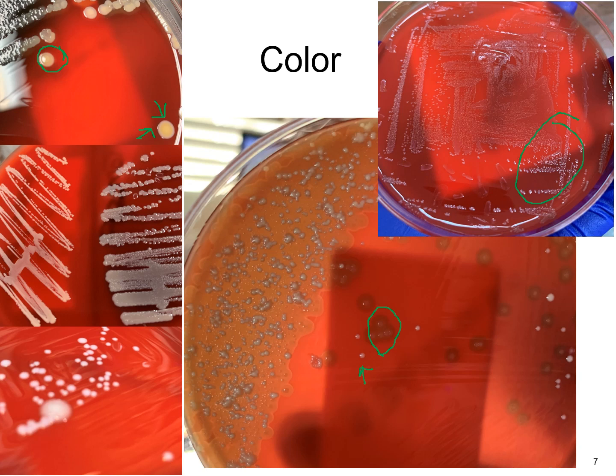You can see these colonies at the bottom pretty well, that they are a little bit raised. And so when you have different organisms, based off how it looks growing on the plate, you can start narrowing down what the organism is. And you'll learn these characteristics as we get into the next course of microbiology and focus more on the bacteria.